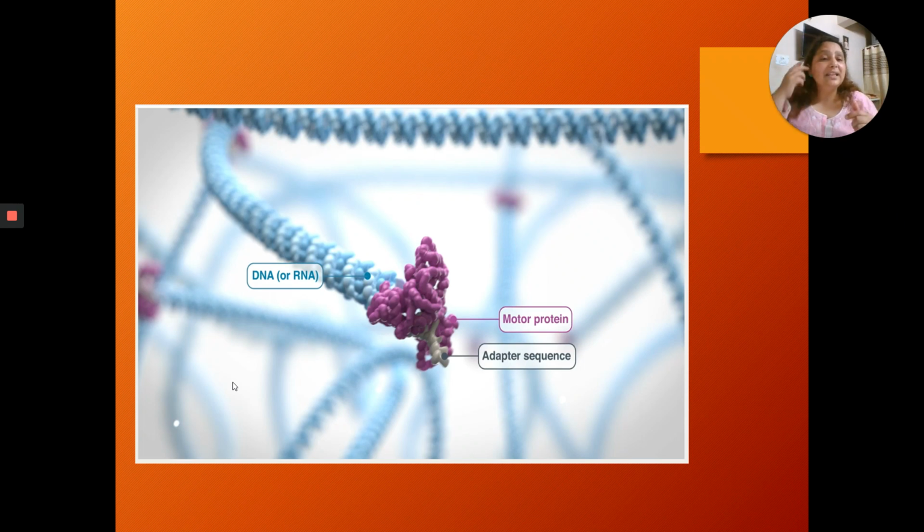What needs to be done? What is our requirement? हमें ये चाहिए कि this DNA molecule must not float around in 3 dimension, rather in 2 dimension. ये DNA molecule must go inside the nanopore. Okay, because जब तक ये nanopore के अंदर नहीं जाएगा तब तक ये DNA molecule करंट चेंज नहीं प्रोड्यूस करेगा और करंट नहीं प्रोड्यूस करेगा तो सीक्वेंसिंग सिग्नल नहीं आएगा. So we do not want the DNA molecule to be floating around.